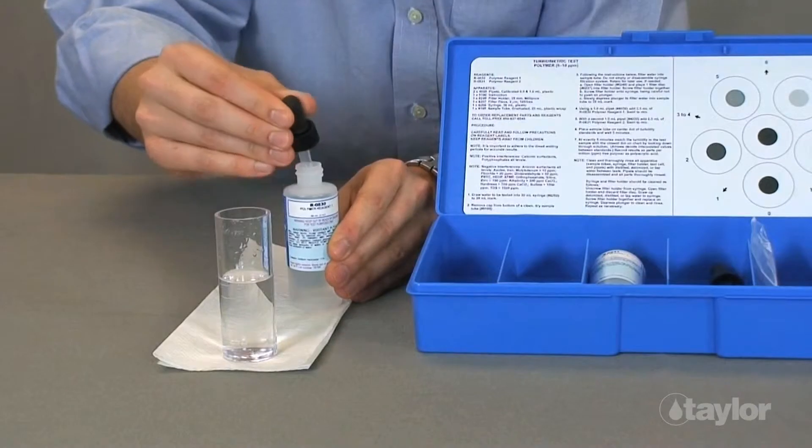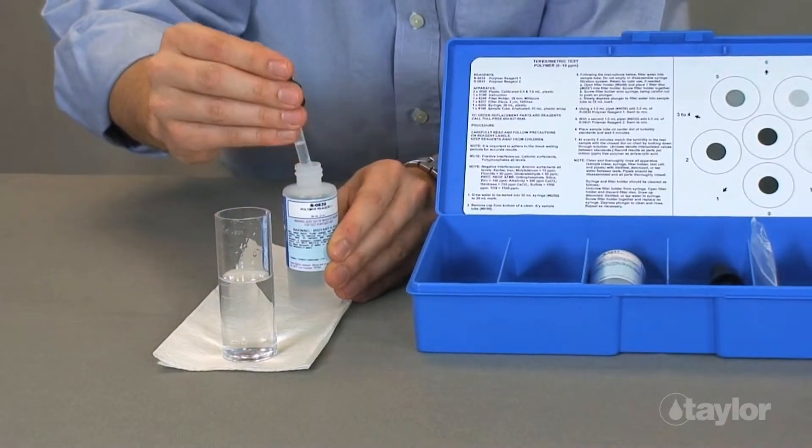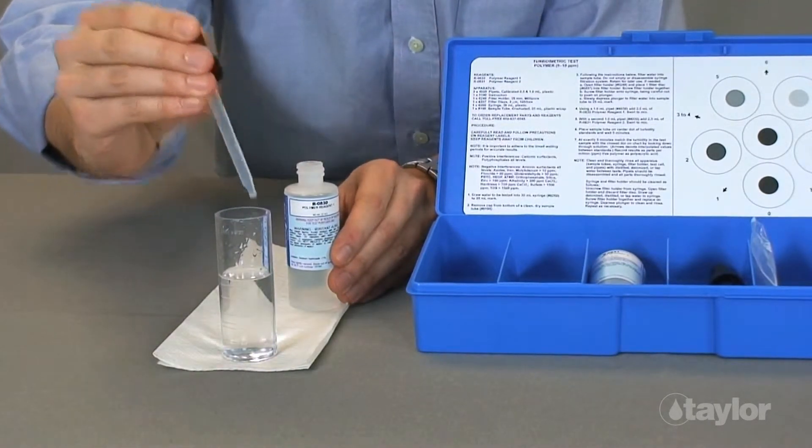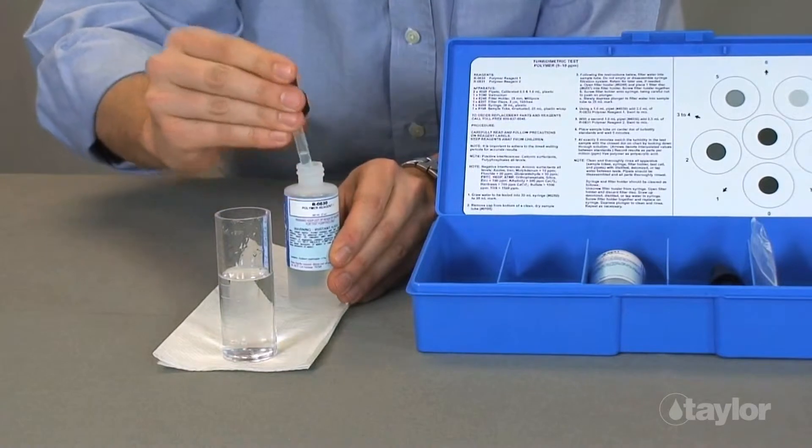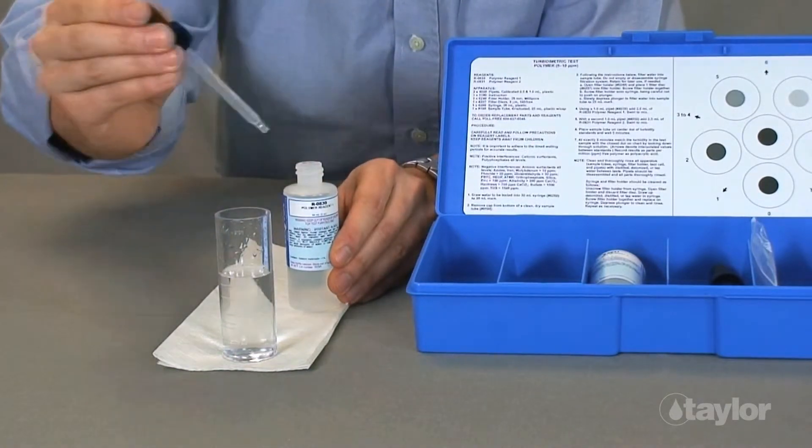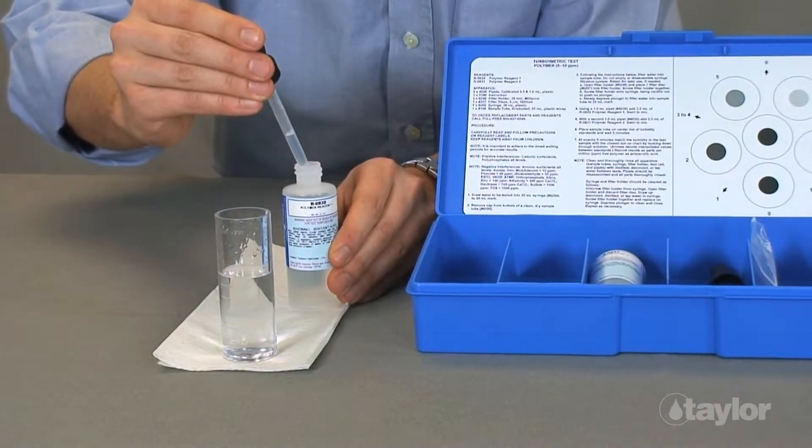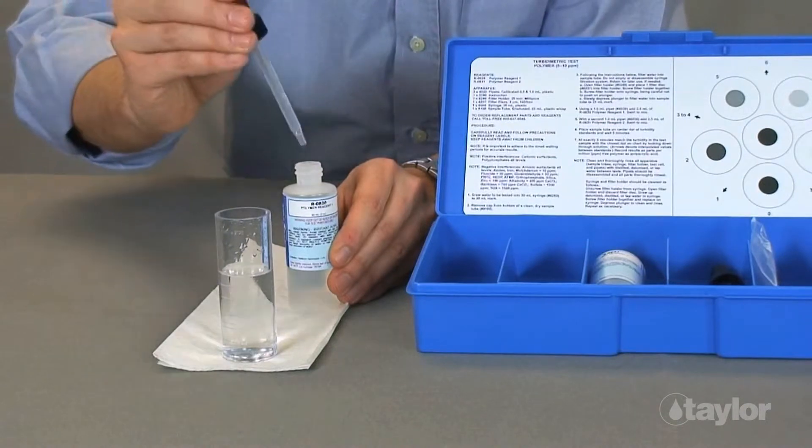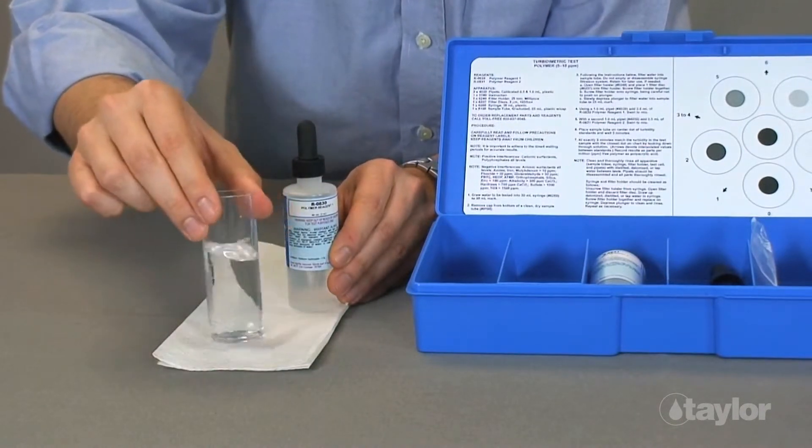Use a 1 milliliter pipette and add 2.5 milliliters of R0830 polymer agent. Swirl to mix well.